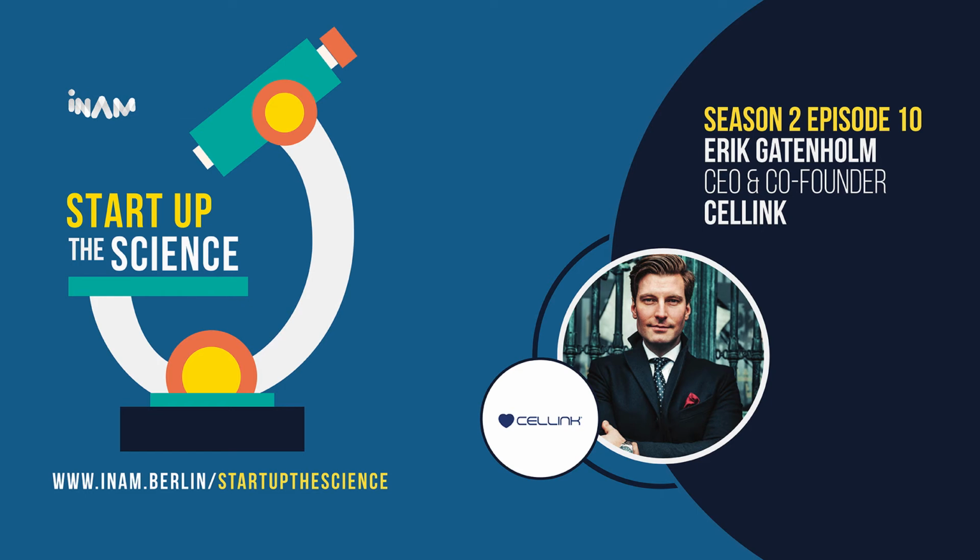And then we looked at the 3D printing industry, and we said, well, there's this technology coming about called 3D bioprinting. It's a subset of 3D printing, but instead of using plastics and hard materials, you essentially use soft materials and human cells. And by doing that, you have the ability of printing essentially tissue. So if you want to print cartilage, well, then you have to use cartilage cells. So these are called chondrocytes. You put these cells inside of a gel that resembles cartilage, human cartilage, and then you print out an ear or a nose or a part of a knee or whatever it is that you want to print out.